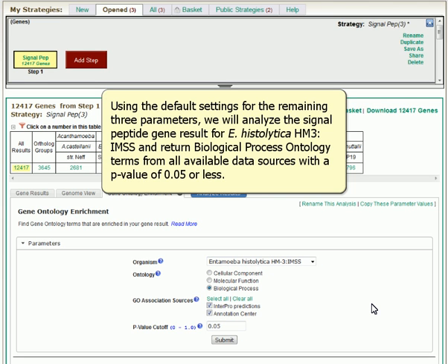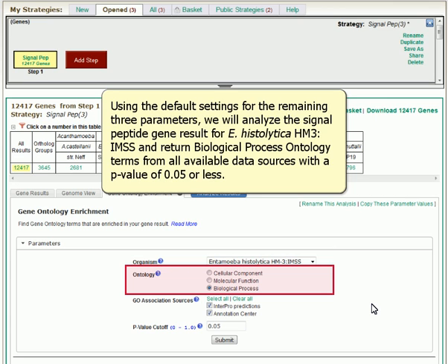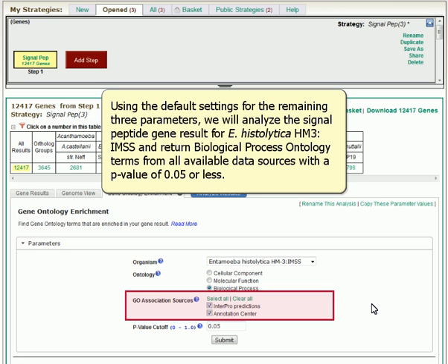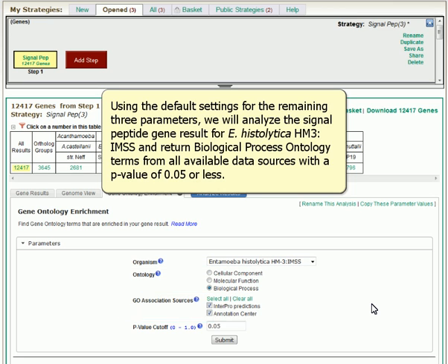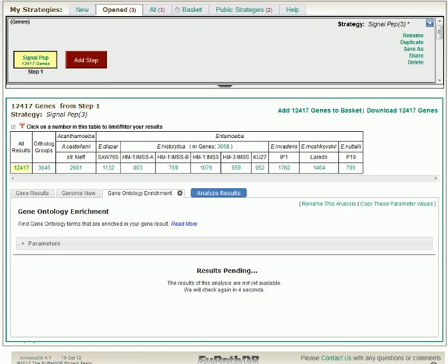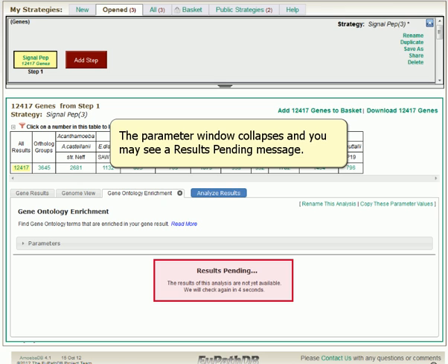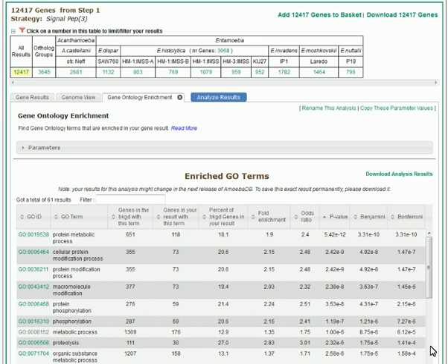Using the default settings for the remaining three parameters, we will analyze the signal peptide gene result for E. histolytica HM3-I-MSS and return biological process ontology terms from all available data sources with a p-value of .05 or less. The parameter window collapses and you may see a results pending message.